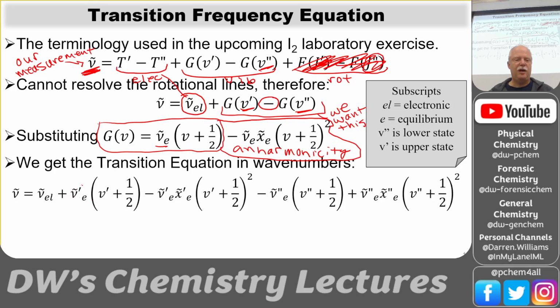So this is the V prime ones. So we have a plus value here and a minus value here. You see this minus sign here. And then when we subtract the V double primes, we get a minus sign here and minus a minus, so it becomes positive. So that's why that's a positive. This is our spectral peak pick values.